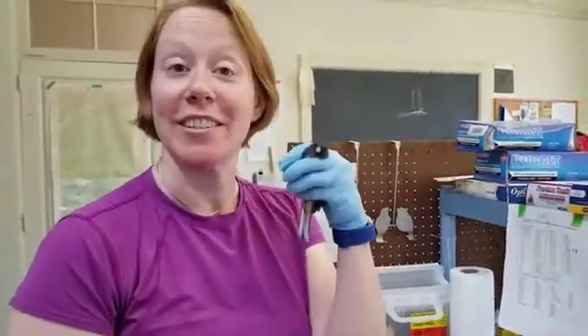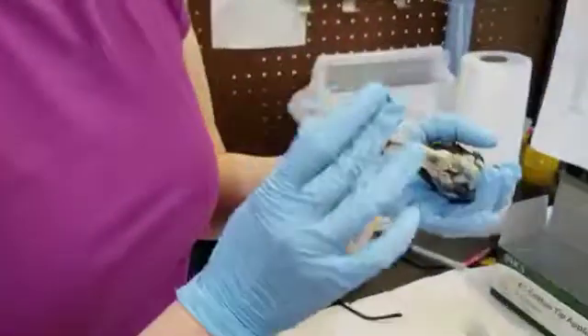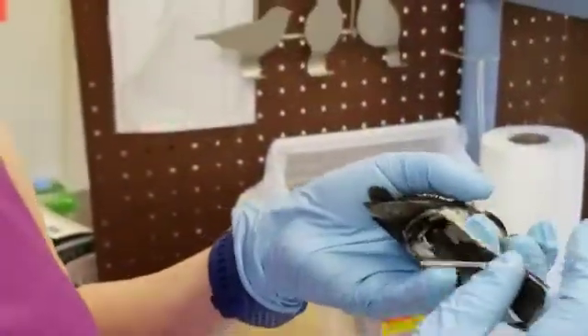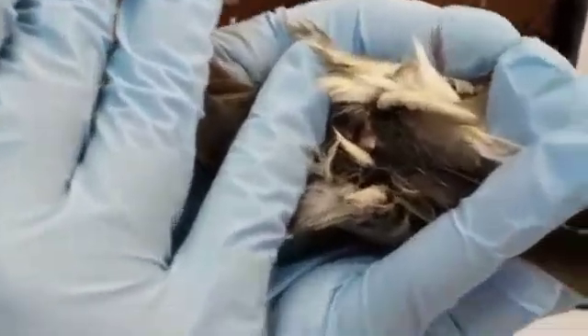Hi, I'm Danielle Whitaker and this is a Dark-Eyed Junco and we're going to show you how to take a preen oil sample. So first I hold the bird in a modified Bander's grip with the tail held down. There's the preen gland there.